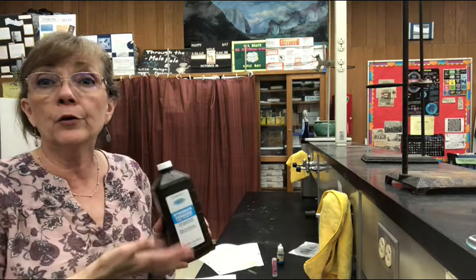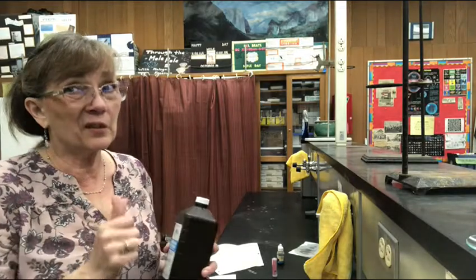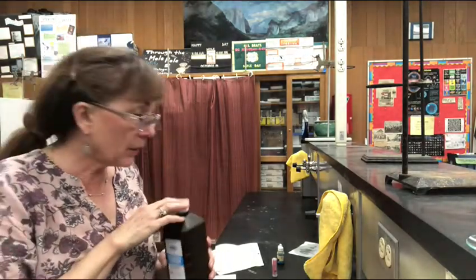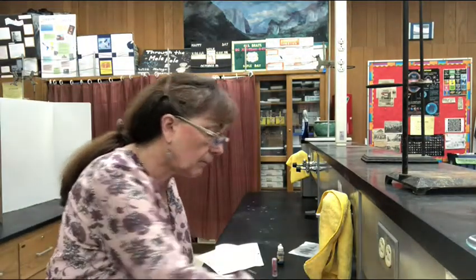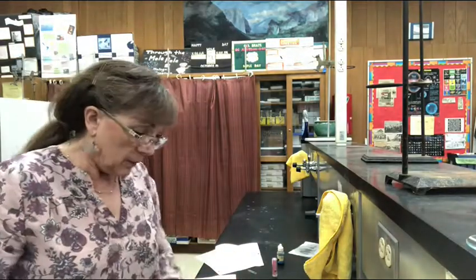If you wanted to lighten your hair, you could use this, but you probably want something that's around 5 or 6%, which would help lighten your hair. The 6% stuff is pretty irritating, and if you've ever done any hair coloring, the bleach that they use is actually oftentimes hydrogen peroxide. It's not really like bleach that you use in your laundry. It's not doing a whole lot.